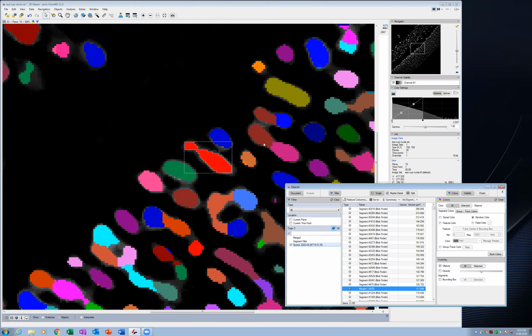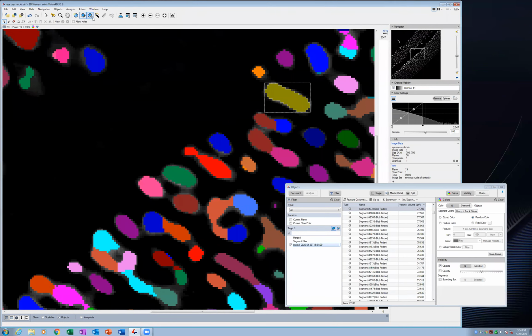All right. Now let's say we had another one like this one, but we thought this was actually 2 nuclei. So this is a little more labor intensive, but basically what you do is go back to your drawing panel, grab that eraser tool, just make it nice and small. And then what you have to do, now here you need this selection tool, and then grab the eraser.